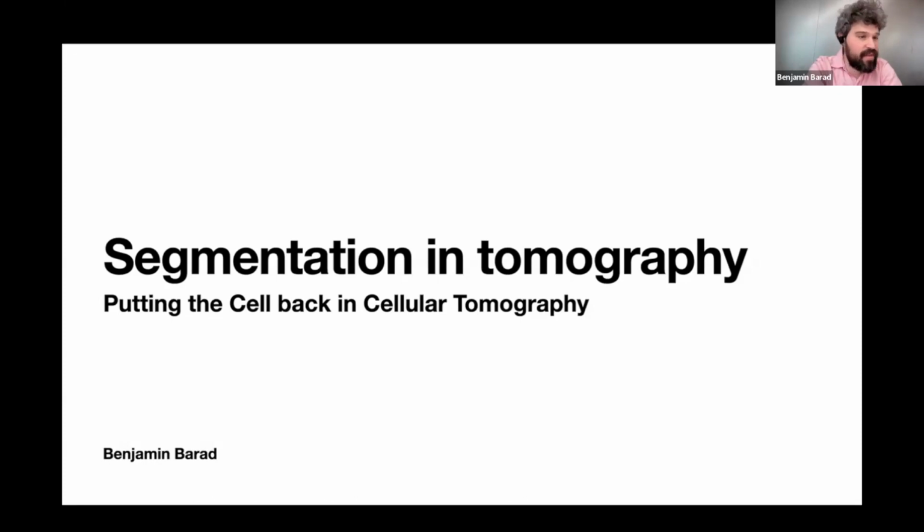The segmentation workflow for filaments hasn't changed that much, so I will probably not do that again, but the video is available. What has changed a lot in the last year is that segmenting membranes has become more or less trivial now, and it was quite challenging before. So I'm going to show that off, and you're going to get to see a full tomogram get segmented, hopefully in about 10 minutes at the end. That's a little bit of movie magic.